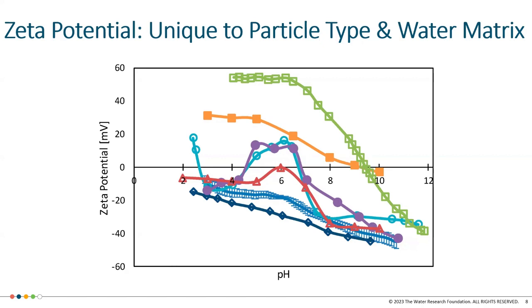And you see that it doesn't have to be consistently decreasing. It can decrease and go back up and then down again. It really varies with the system conditions, and so we shouldn't make any assumptions. It's best, of course, like with most things in water treatment, to know your system.